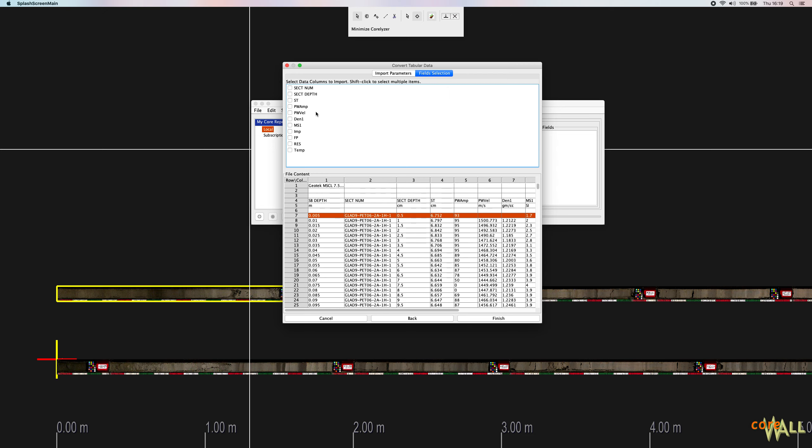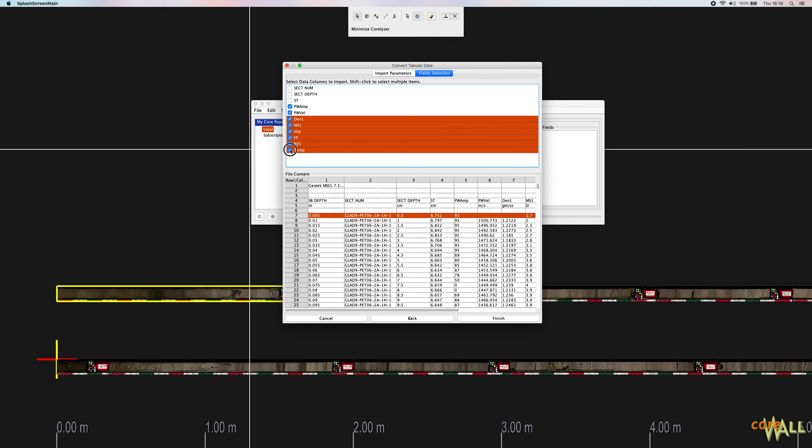Now select the data columns to be imported by checking the boxes to the left of the column names. Potentially, you might have lots and lots of data columns that you want to import and don't want to click them all. You can also check a range of columns by holding the shift key and clicking. So I just selected that whole range of columns by doing that. When your data columns are selected, click the finish button.